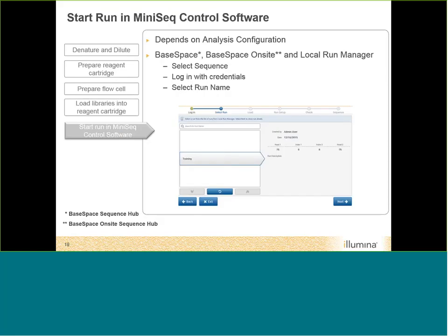To start the run, place your cartridge inside the instrument and load your flow cell. How you proceed depends on your analysis configuration. If you chose BaseSpace or BaseSpace on-site, the control software will ask for your BaseSpace credentials, and you'll see your prepared runs on the list. If you selected Local Run Manager, the control software asks you to log in with your Local Run Manager credentials, and then you will see your list of runs ready to go.